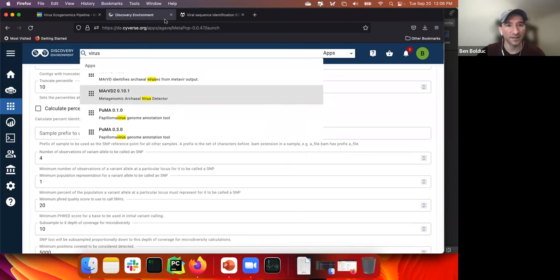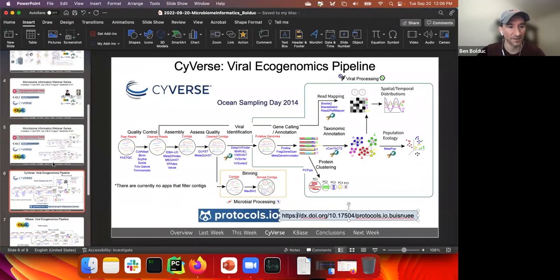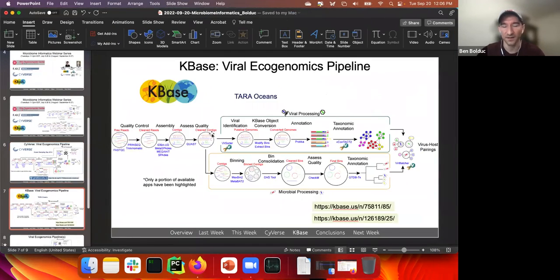So the next thing I wanted to focus on, I'll give us all a second to breathe. Okay, so KBase is the next step. And there are two protocols here that I've done.